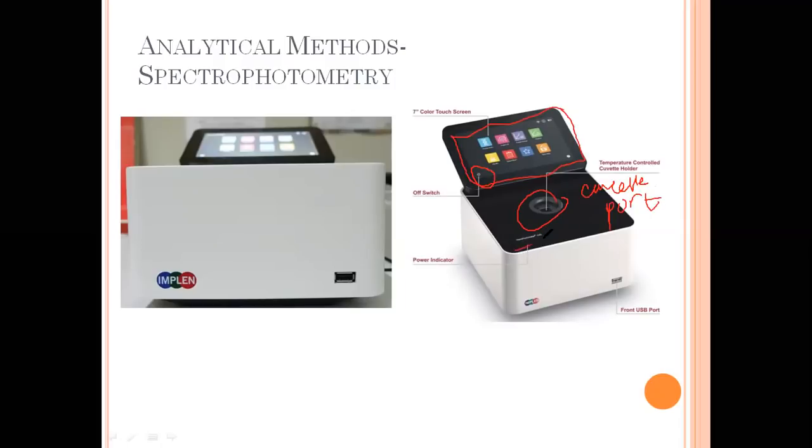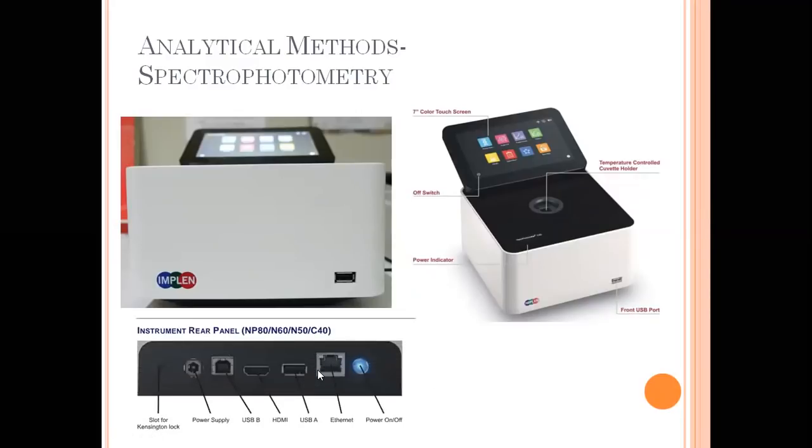You have here, okay, the power indicator. So pagka umilaw ito, ibig sabihin bukas na siya. Okay? And again, this is what we call the USB port. Though not limited to that, okay, at the rear panel, we have these different features.